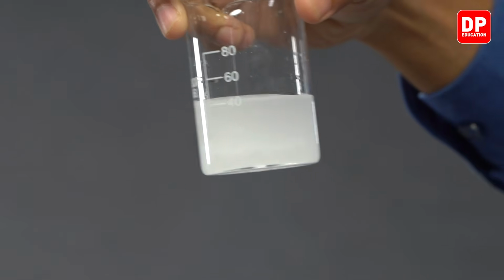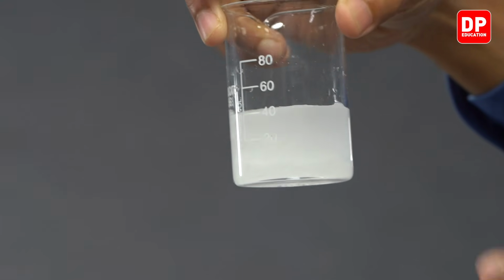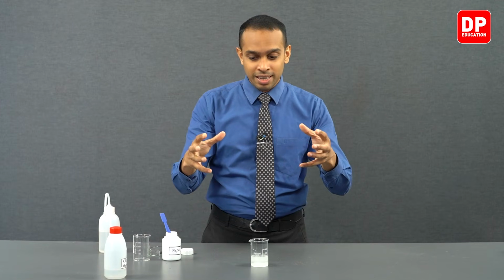Right now, after I mixed it, it is not very clear to observe. We'll allow this to settle for a while and we'll come back to it and observe how the sodium sulfate actually is not found as a powder anymore. It is actually clumped together in this aqueous medium after coming into contact with water.